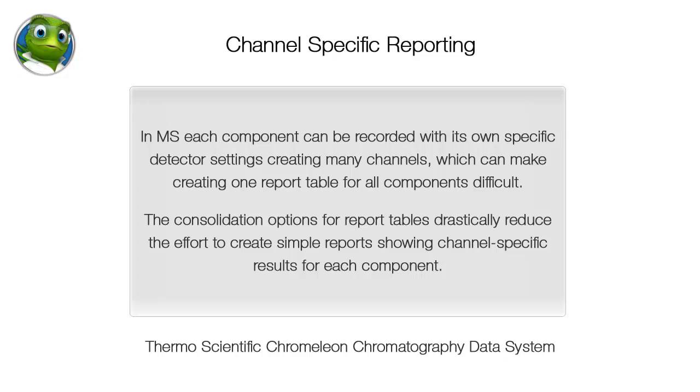The consolidation options for report tables drastically reduce the effort to create simple reports, showing channel-specific results for each component.